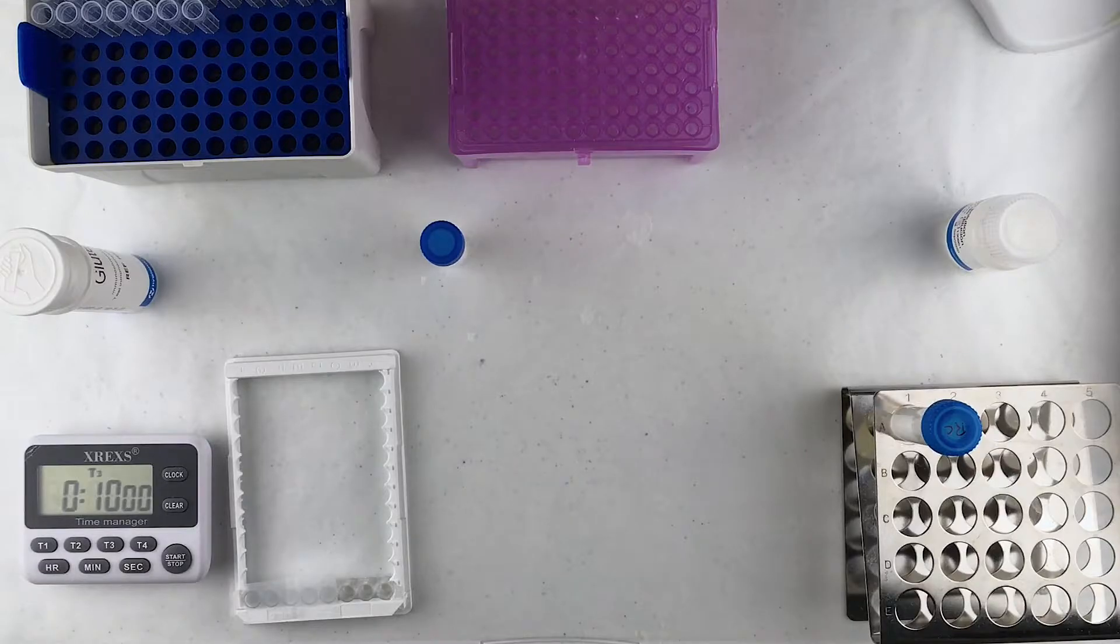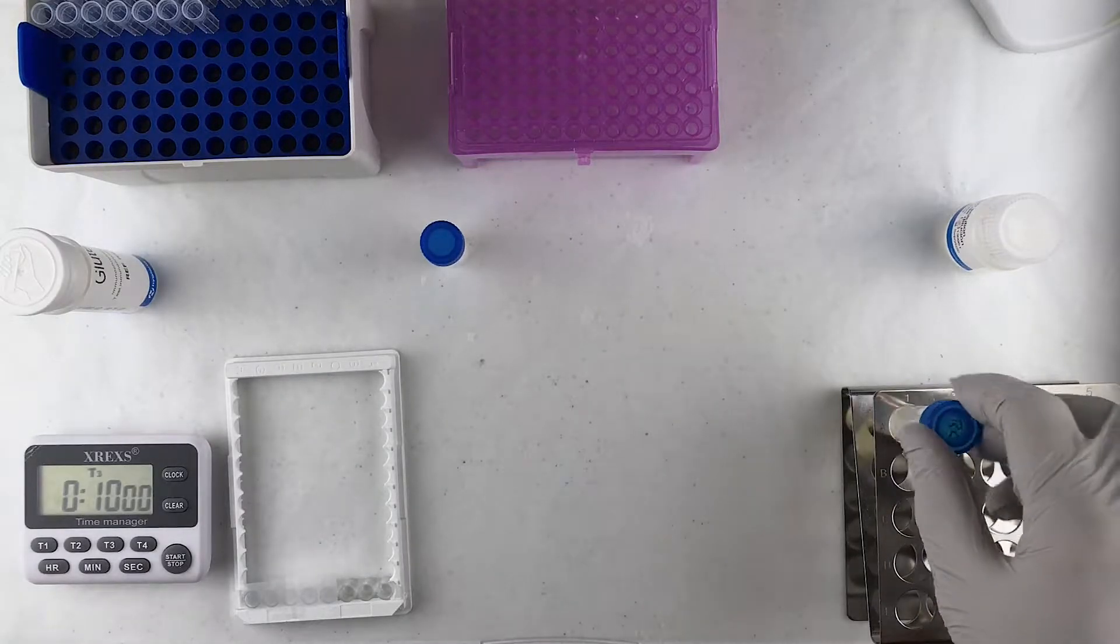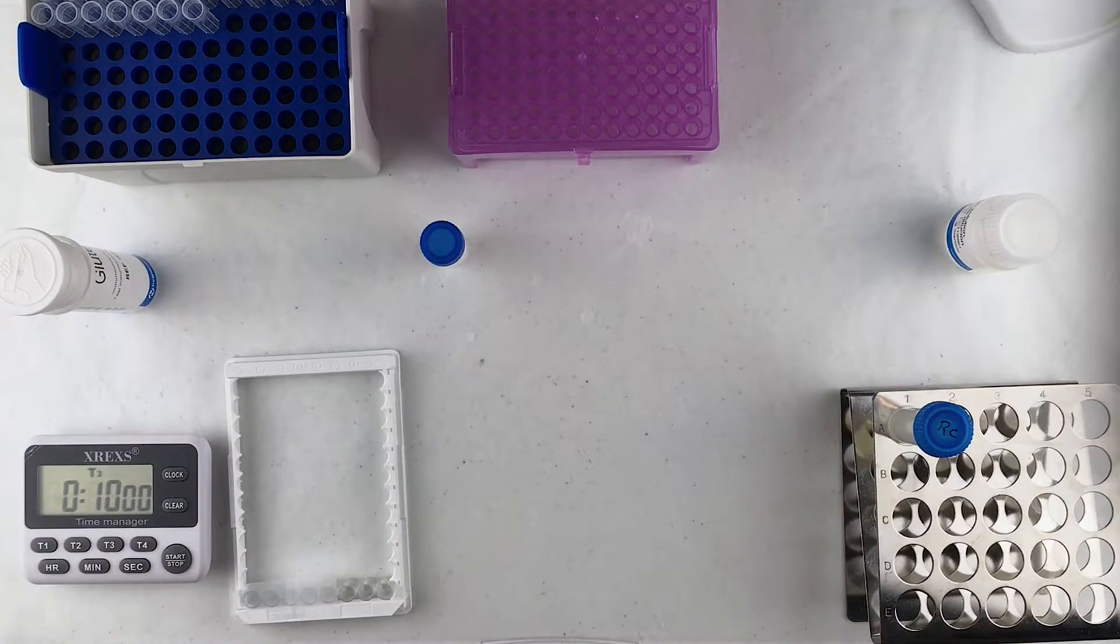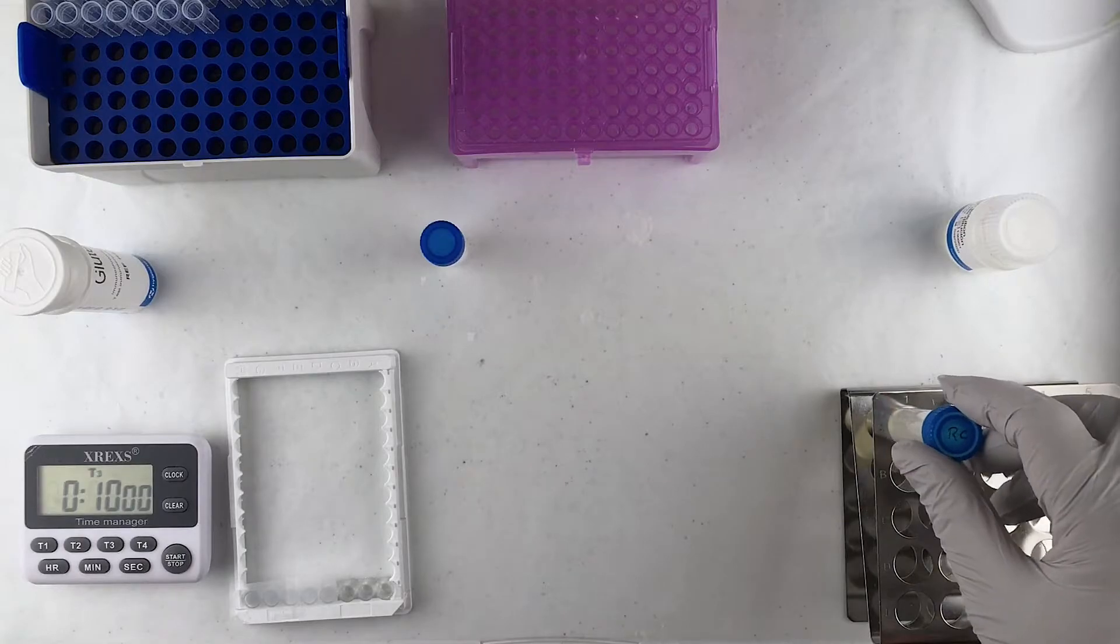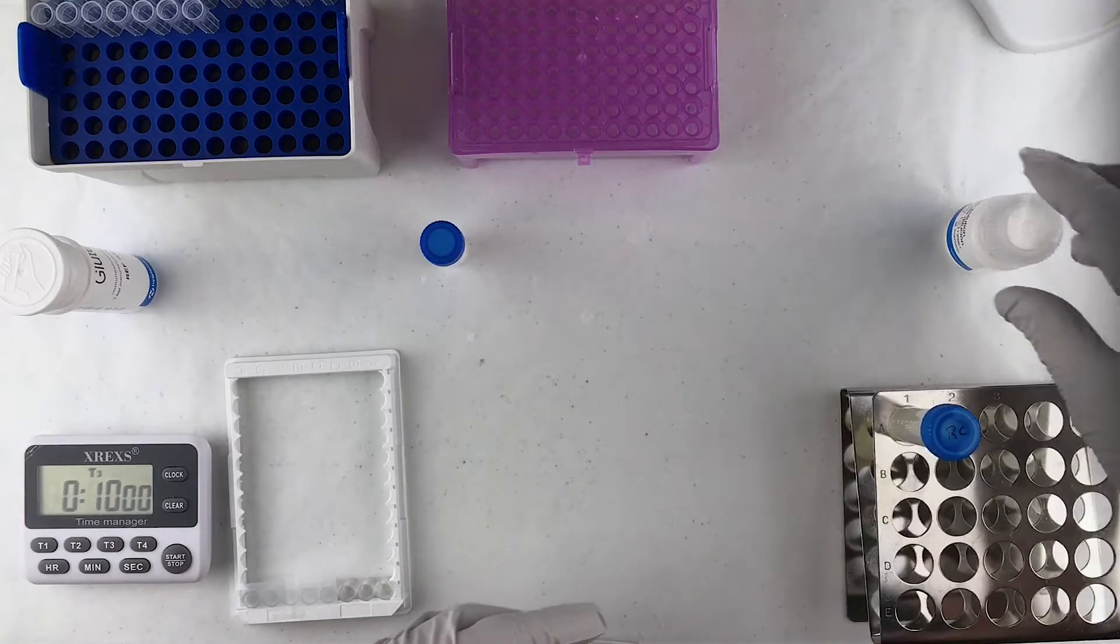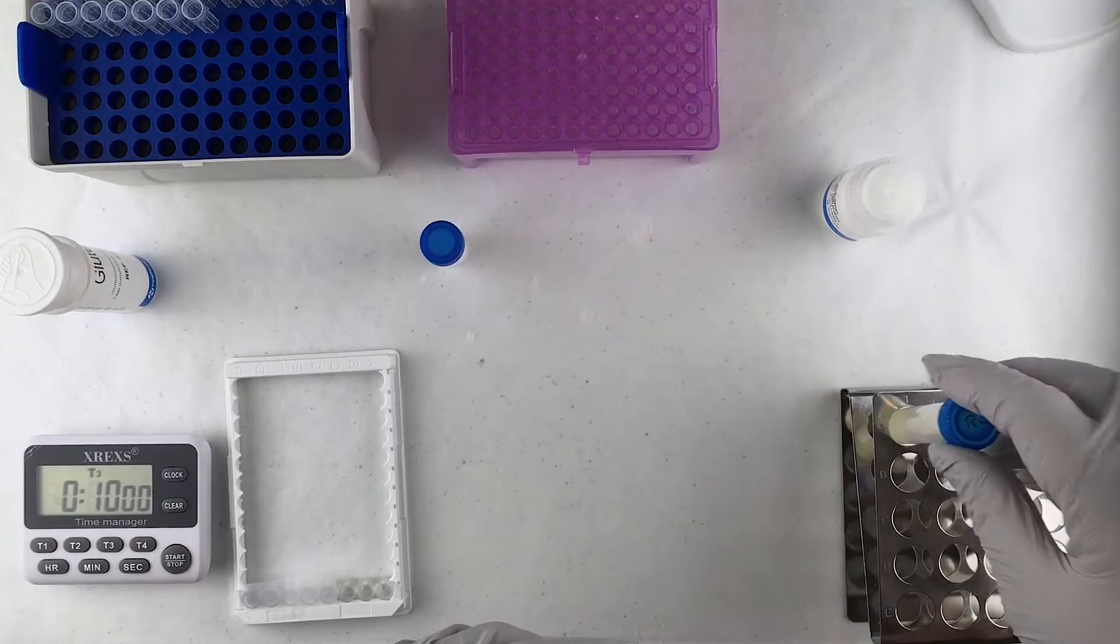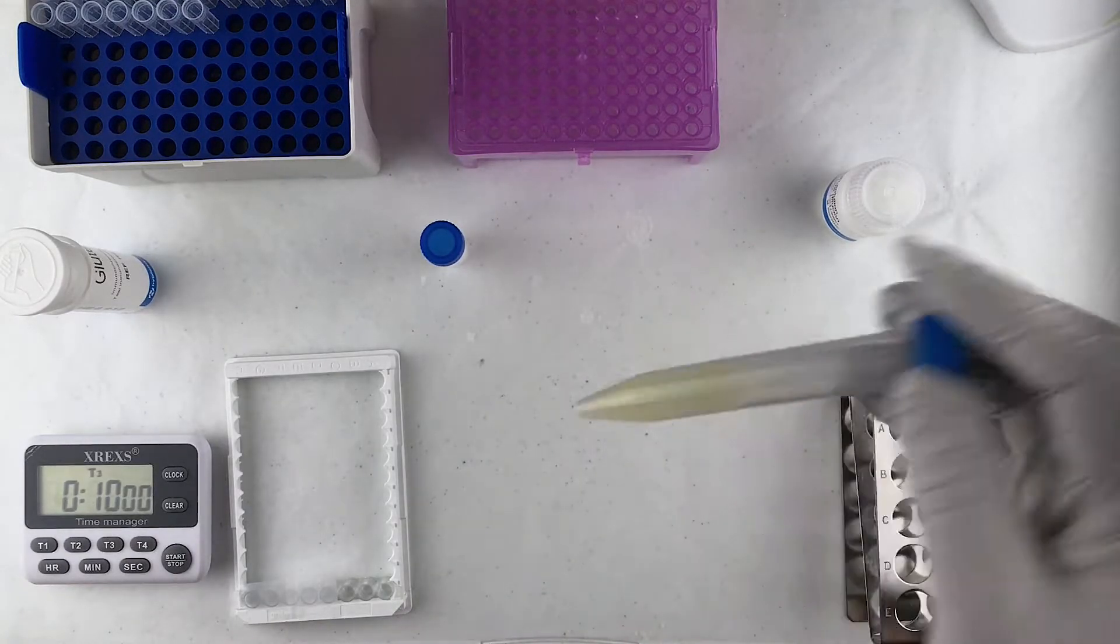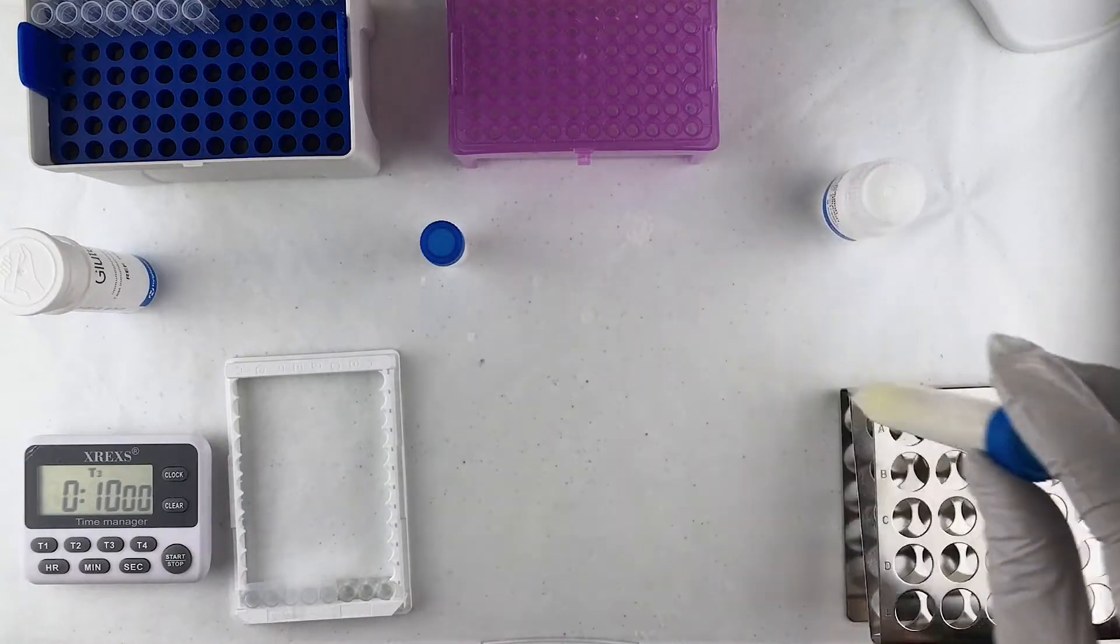Now we're ready to finish up the testing on General Mills Rice Chex. So this is the dilution phase and then we'll proceed to the analysis. So for the dilution, what we do is we mix some dilution solution, which we have here, with an appropriate amount of the extracted food sample, which we have here.